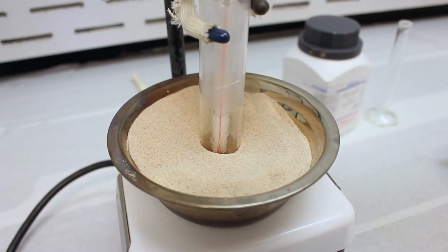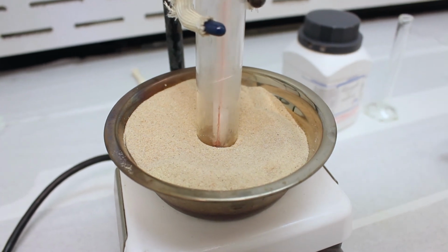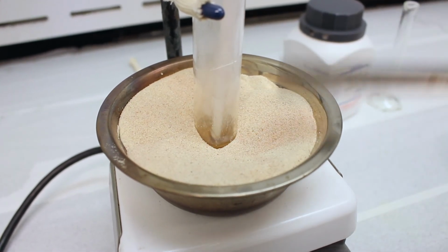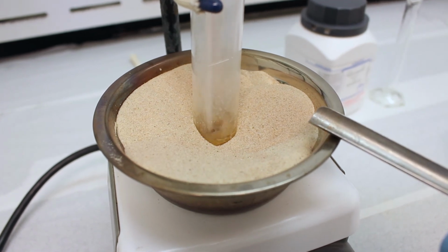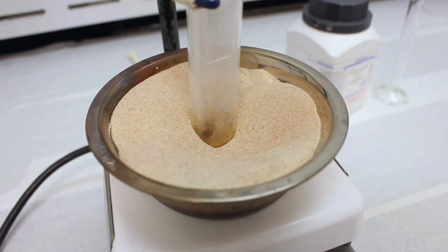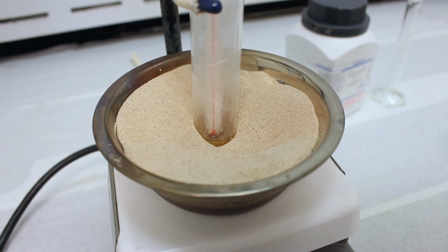Okay, so we've been heating it, and we've just about approached 160 degrees Celsius on the thermometer. But if you'll notice, maybe you can see if I move some of the sand, the solution here is actually beginning to boil. This is a new sand bath we have, and it's very good at heating. We've never seen heating this good in our experiment before. And you can see that the solution's actually boiling. It's that hot. So I'd say we're at about 160. Yeah, there we go. And we've even passed it, 160 to 170.